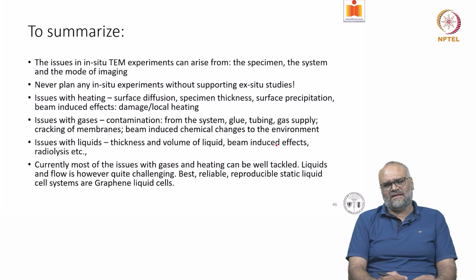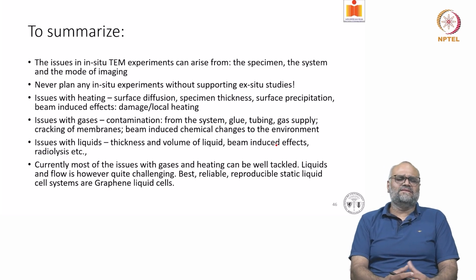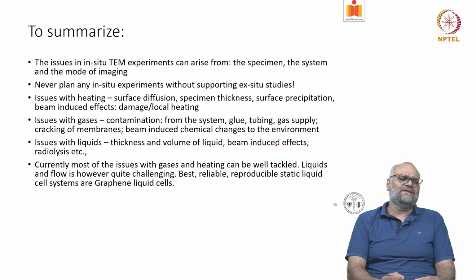So all said and done, in situ electron microscopy can be an exciting area, but do not think that every experiment can be done only with in situ electron microscopy. Please plan out proper supportive ex situ experiments and define a problem.